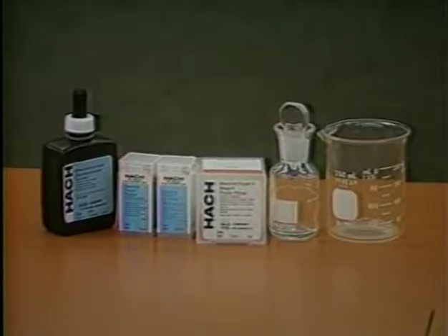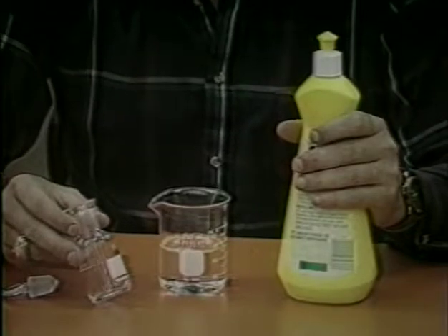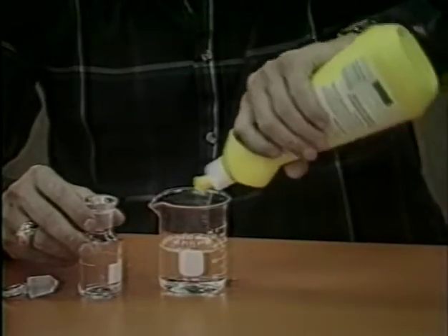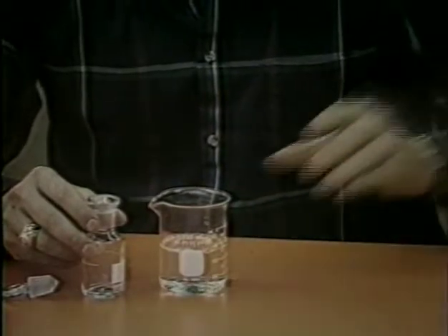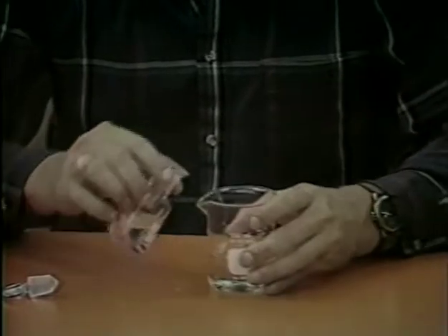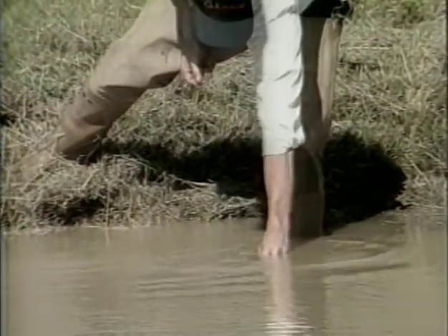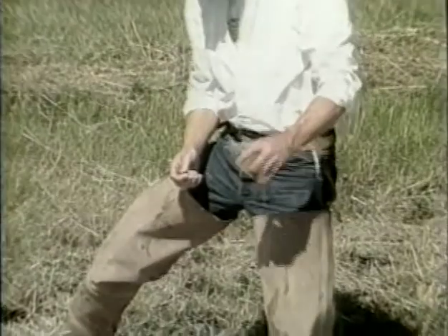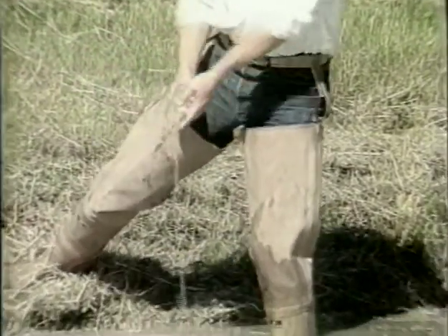To measure dissolved oxygen using the water quality test kit, proceed as follows for the high-range test. Obtain a water sample from the pond by using the glass stopper dissolved oxygen bottle provided with the kit. The bottle should be cleaned before and after each use. To clean the sample bottle, use dishwashing detergent, making sure that it is rinsed well with clean water, preferably distilled or tap water. The sample should be taken away from the pond bank to avoid vegetation. Sample away from aerators and inflowing water, and preferably with the wind at your back.